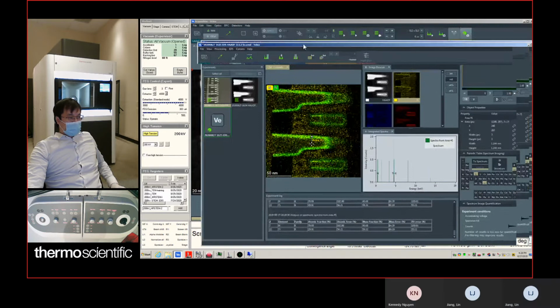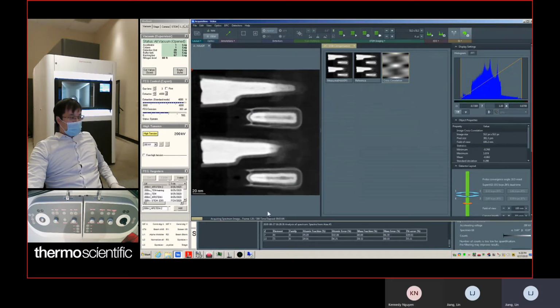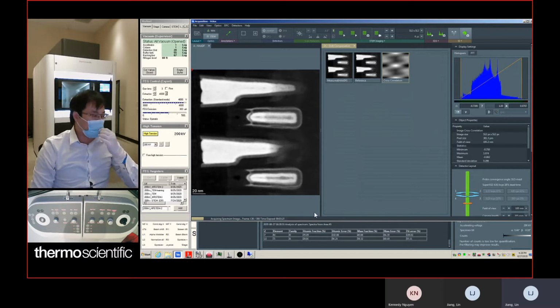We're going to stop at 5 or 6 minutes, so we're going to maybe stop when it has reached 6 minutes.